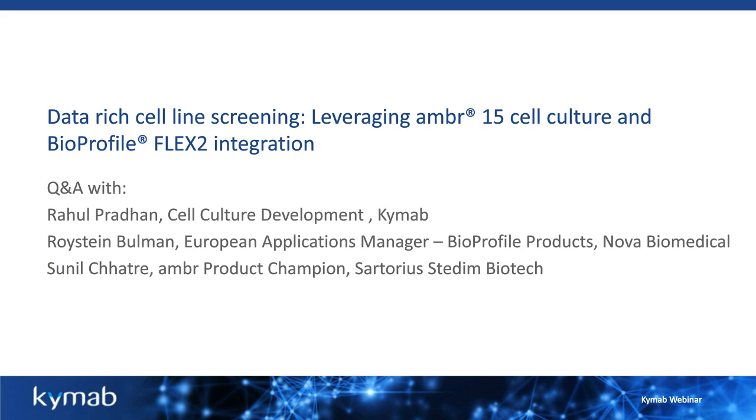Okay, so this is probably a question for Nova Biomedical. Does the FLEX2 have IgG measurement? No, the FLEX2 does not have IgG measurement. That was available on the predecessor device, the BioProfile FLEX.